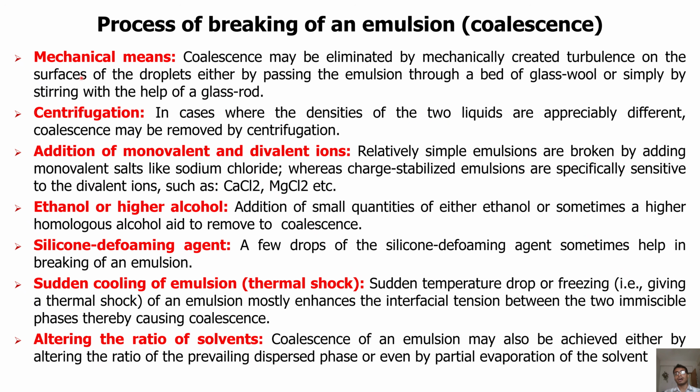Now we will see the process of breaking an emulsion. Suppose your emulsion has already been formed. Then what should you do? In previous slides, we have seen the prevention of emulsion formation. Now we'll see the curative action for breaking the emulsion, because it is undesired and unexpected.